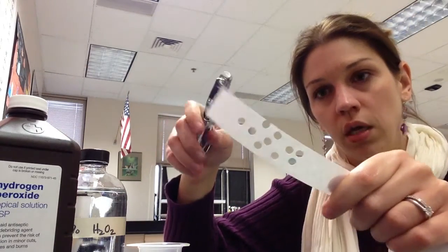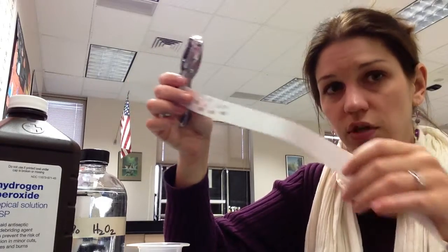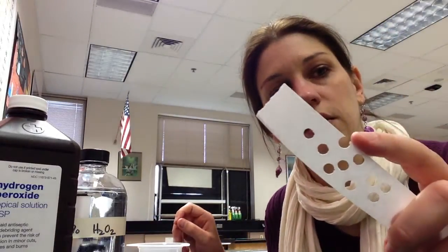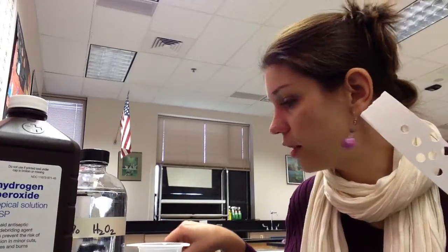But what you're going to do is you're just going to hole punch a bunch of holes, okay, and I got like miles of this stuff, so don't worry about being too frugal with it, but you're going to hole punch a bunch of them. You want to be pretty consistent with size. If you end up with one that's on the side like this, don't use it, but that should be one of your constants. And you're also going to need a 50 milliliter beaker. And in fact, if you want to get 2 or 3 beakers, if you have enough of them in your inquiry kit, you may not.